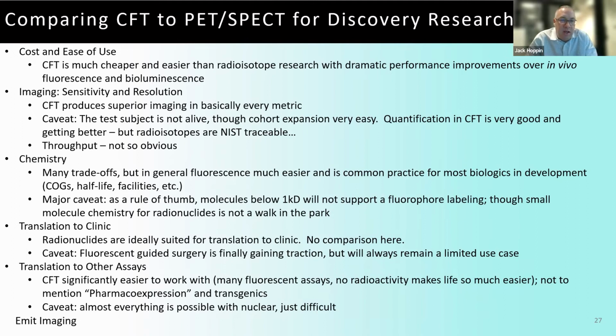Throughput, I just want to add, quantification of CFT is excellent, and the team is working hard to improve it. The relative quantification, I think we certainly struggled with it in terms of settings, but I think the system now, if your protocol is paying attention, the relative quantification is phenomenal. We're working hard to characterize the absolute quantification, but it will never compare to radionuclides. I mean, radionuclides are the essence of quantification and always will be.